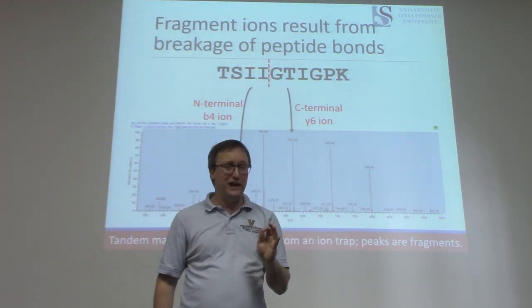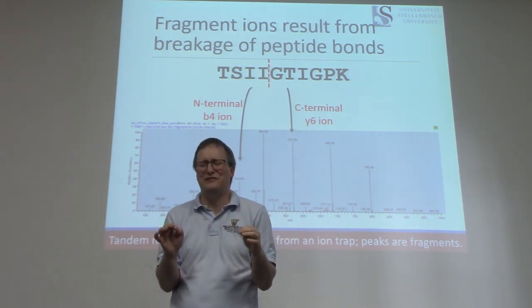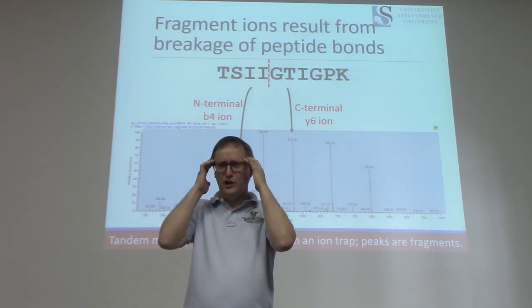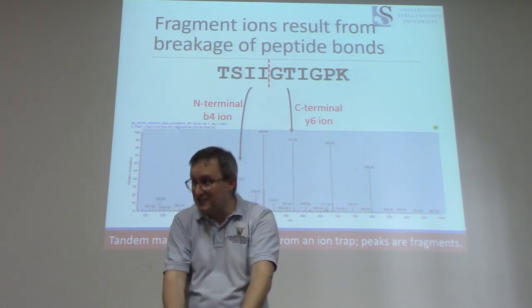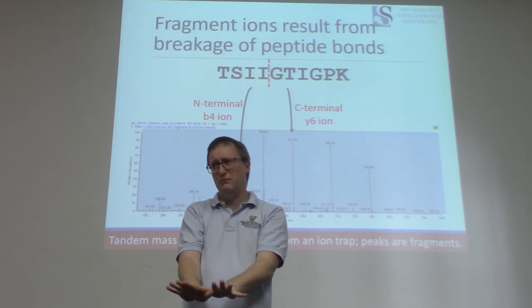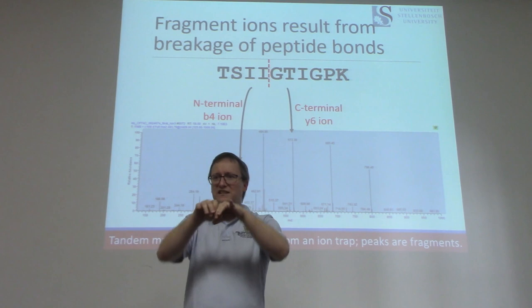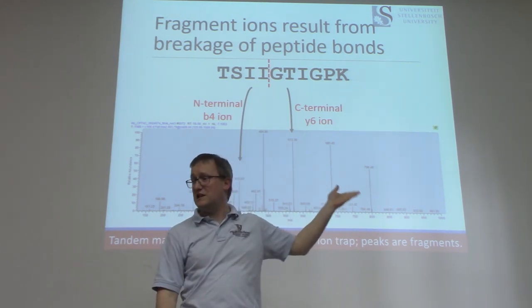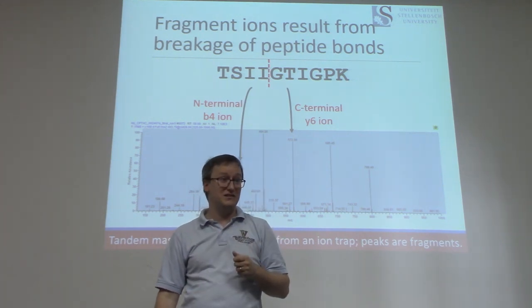Okay, so hopefully, I know we've belabored this exercise. I don't expect you to reproduce this on a quiz or something. That'd be awful. But if you now have proven in your mind that the sequence of the peptide relates to the fragments we see in the tandem mass spectrum. Has everyone got that part? Some yes, some no. All right, so as these peptides break, the fragments that they produce, the dominant peaks that we see in the tandem mass spectrum, should be explainable given the peptide sequence.